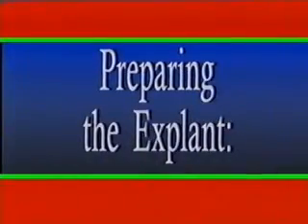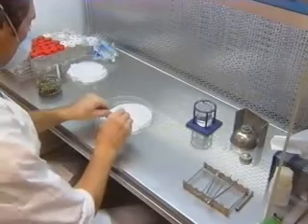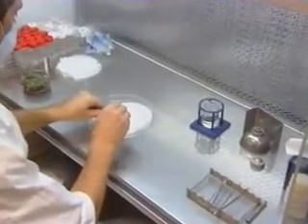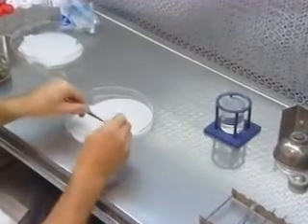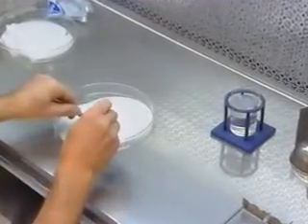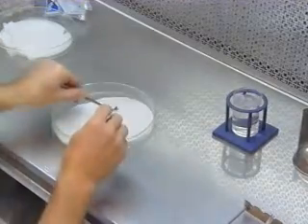Now let us look at the preparation of the explant. The exact method for preparing the explant varies with the kind of explant. In general, all procedures described up to here should be followed. If shoot tips are used, remove the disinfested shoot pieces from the rinsing solution and cut away the enclosing leaves with sharp scalpels or needles to expose the immature shoot tip.